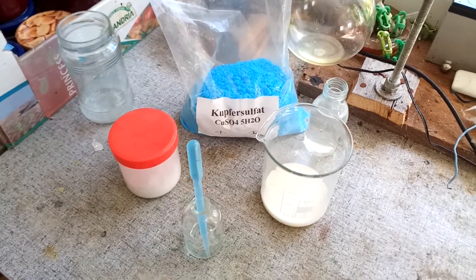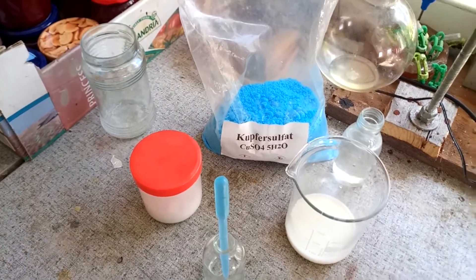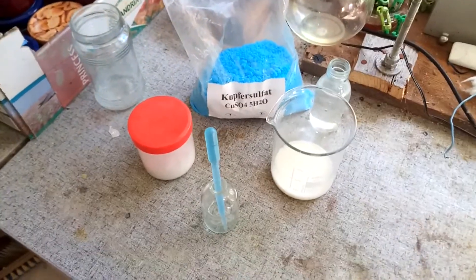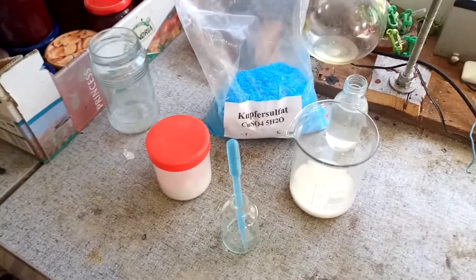Hello everyone. Today we are taking a look at the Biuret reaction. The Biuret reaction is basically a test for proteins.